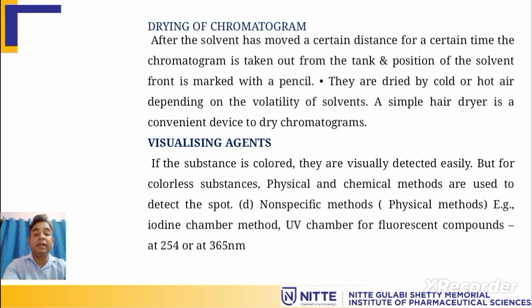The only problem is when you have water as a solvent, or methanol, a highly polar solvent. Sometimes with water you need to use a hot air dryer. Otherwise, at room temperature itself, the solvent will evaporate. Then we have a visualizing agent. It is very easy to visualize when you have dyes, or a colored compound after the separation.